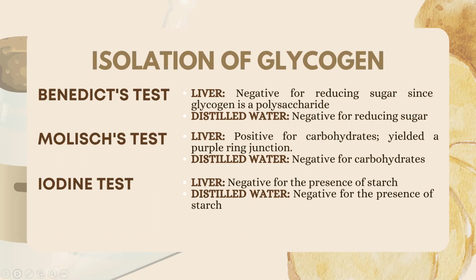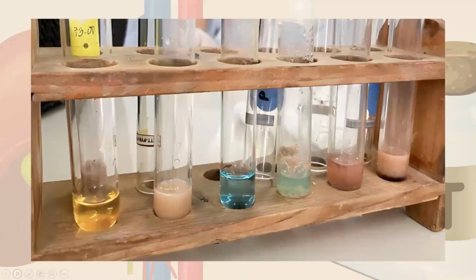And for the iodine test, our liver is negative for the presence of starch. And for the distilled water, obviously, since it is water, there is no presence of starch. So the result is negative. So next slide, the next reporter, please.